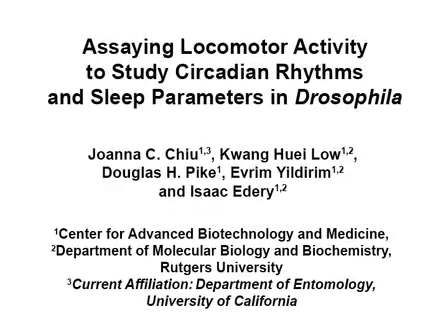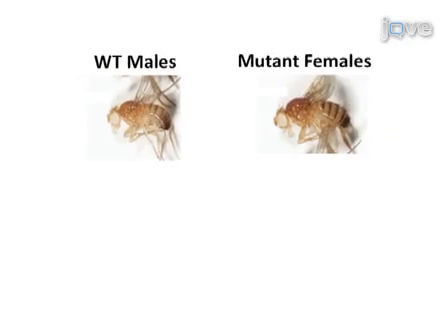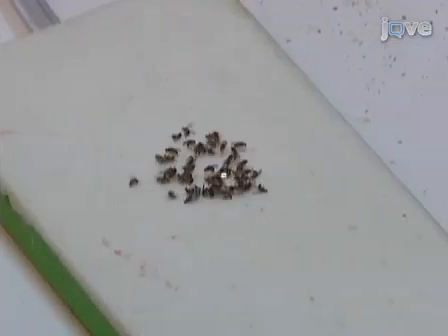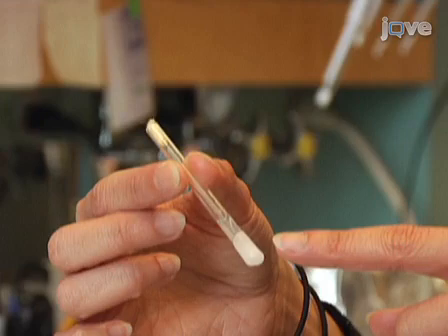The overall goal of the following experiment is to characterize circadian and sleep phenotypes in Drosophila by assaying daily rhythms of locomotor activity. This is achieved by generating transgenic flies, obtaining specific mutants, or setting up necessary crosses to prepare experimental animals. As a second step, glass activity tubes containing a food source need to be prepared, which will serve as the fly habitat during the experiment.